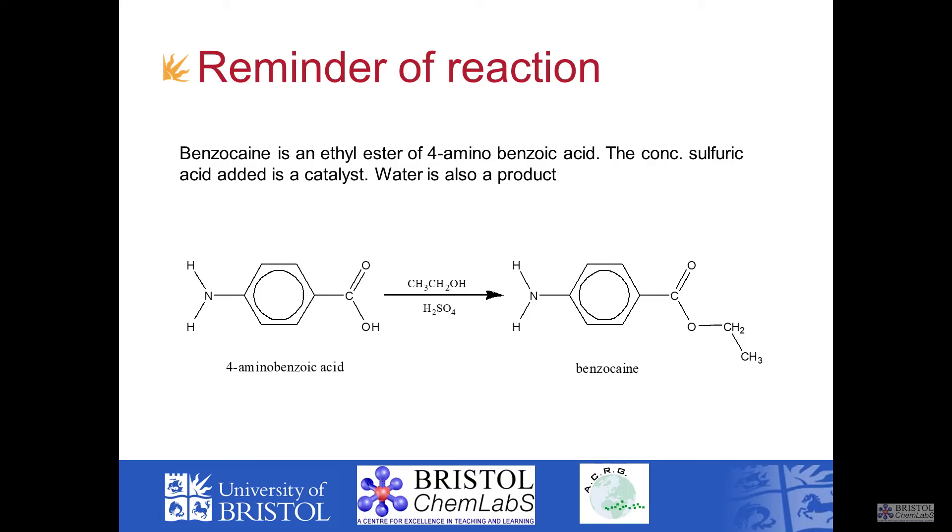So we have weighed out our starting materials on which we're going to base our percentage yield calculations. We've heated up under reflux. We've removed the catalyst and separated out some of the other impurities by filtering out our insoluble product. We've dried it and we've analyzed it through thin layer chromatography, melting point and by infrared spectroscopy.